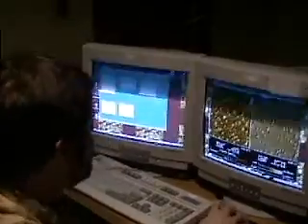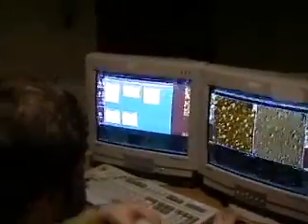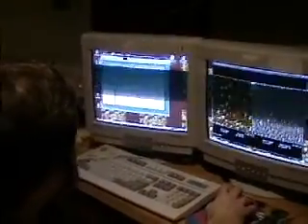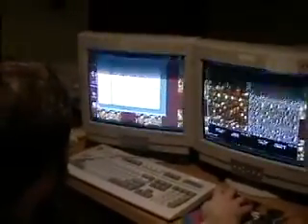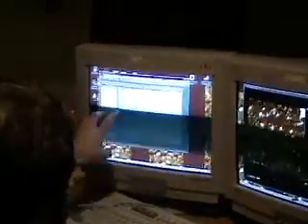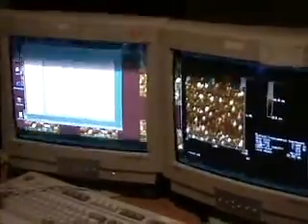Okay, let's talk some more about the other things you might do with the analysis menu. So I'll click on the colorful TV icon in the upper right to bring up the analysis menu, and I'll select left image. So image, select left image, which is the topography image. Usually that's where you want to do your analysis. There are two main things that you might want to do.